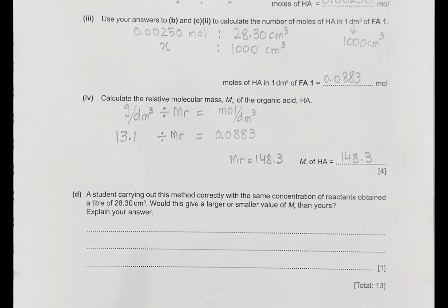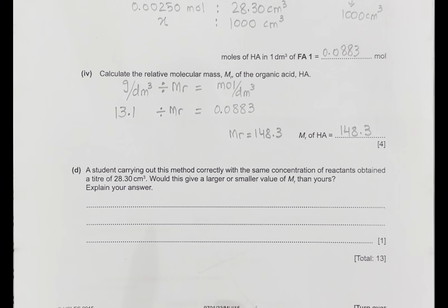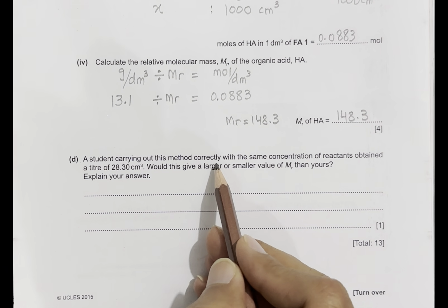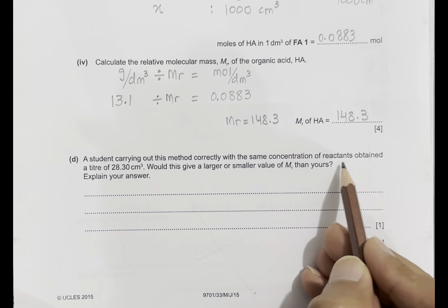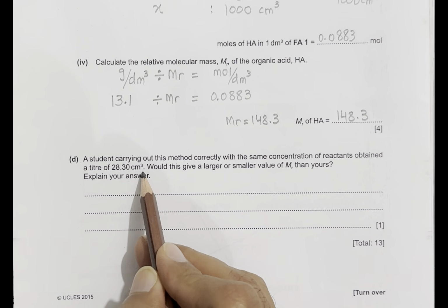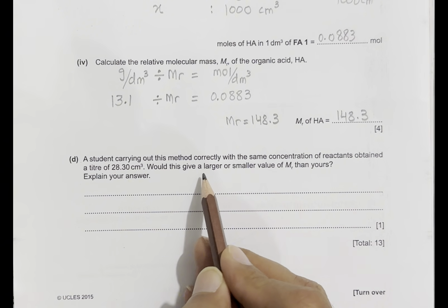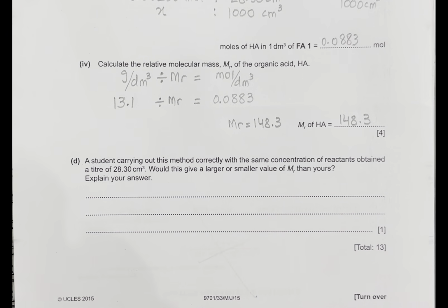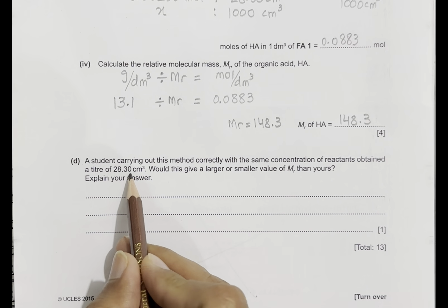Now, let's move on to the next part, which says a student carrying out this method correctly with the same concentration of reactants obtained a titer of 28.30. Would this give a larger or smaller value of MR than yours? As a coincidence, we got the same titer value of 28.30.